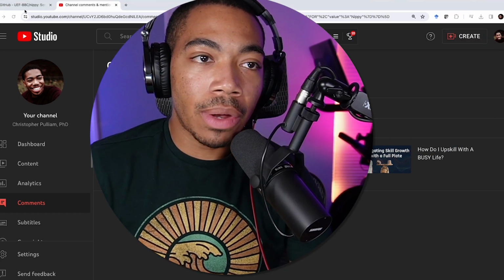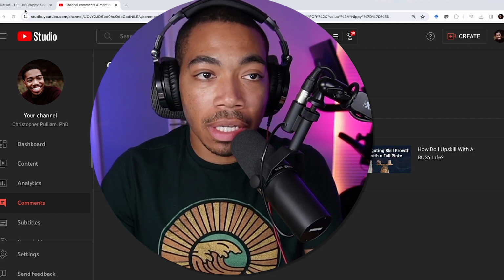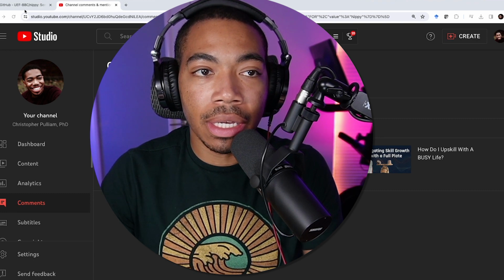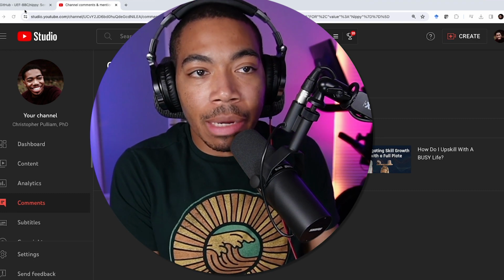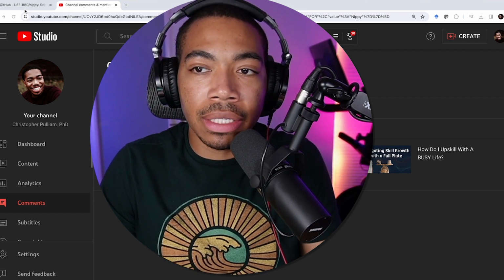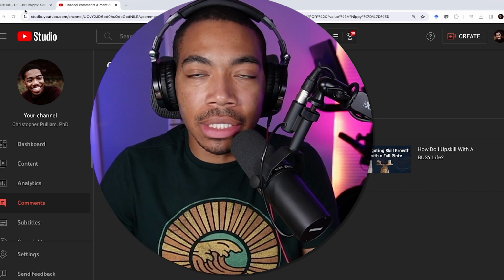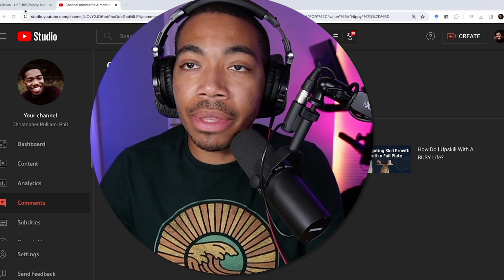So I will actually make two videos out of this because I think there's some value in first looking at the Nippy library, seeing what it has, some of the documentation, and then a separate video where we actually use this library for some data processing. I think they both can stand alone. So thank you for the suggestion. We actually will make two videos from this idea.